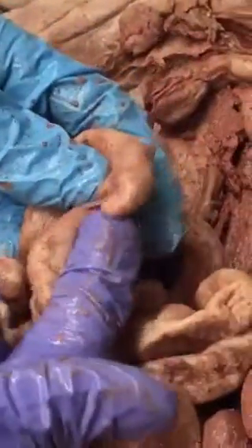Oh, there's something. Do you hear that? It's all squishy. Yum. All right. Like there's a mouse in there or something. Just kidding. This little sac-like section is called the cecum.